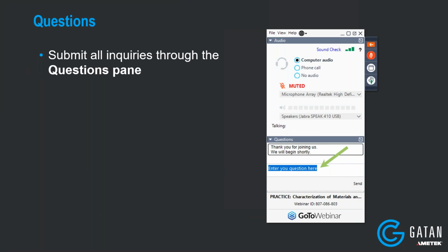So if you are using DENSolutions Impulse to control the biasing of their Lightning holder, for example, you could get the bias information in DigitalMicrograph, have it all integrated like I showed today. You just can't control the biasing from DigitalMicrograph.